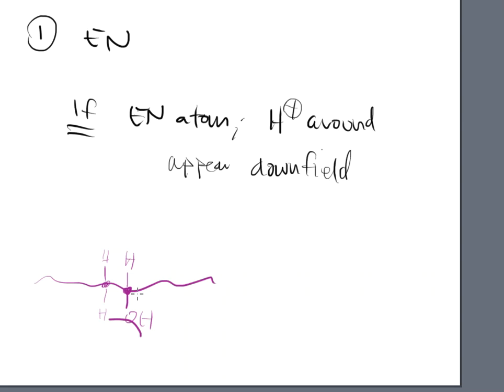So I know that if I don't give you any more information about the structure at all, we're going to see a structure that is here that's going to provide me a signal, and then a structure that is there that's going to provide me another signal at least. Whatever else is happening in the structure, I really don't care. It's all just a matter of comparing. That's what we want to do right now. We just want to compare, and see why things are happening the way they are. So I've got two different signals, two different chemical shifts that will happen in the NMR. One will happen at one location and the other will happen at another location.